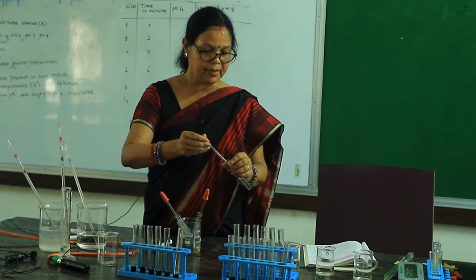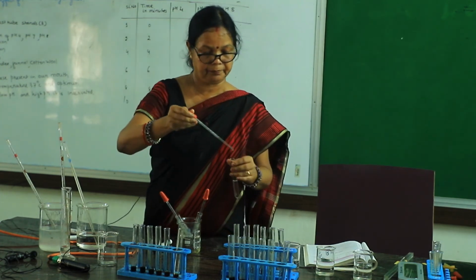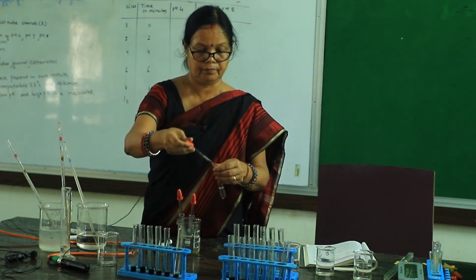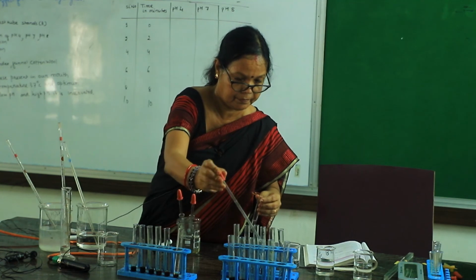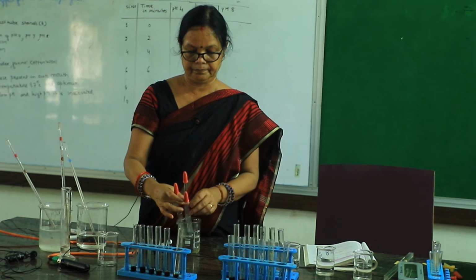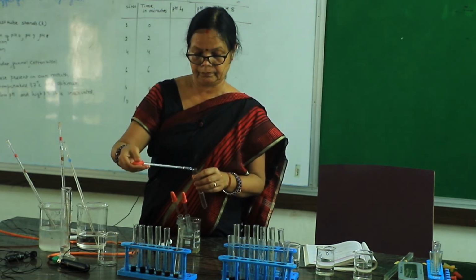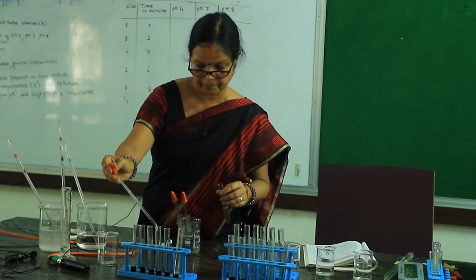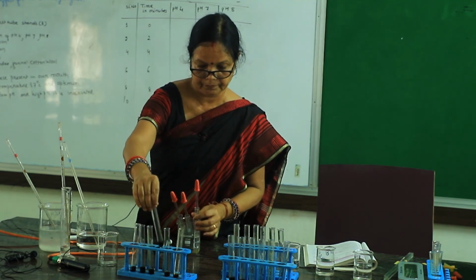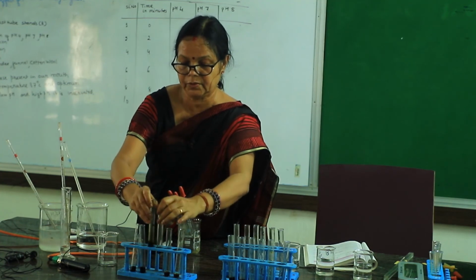So this is the process. With a 2 minute interval, you have to carry out the experiment. pH 7, so it is almost iodine color.